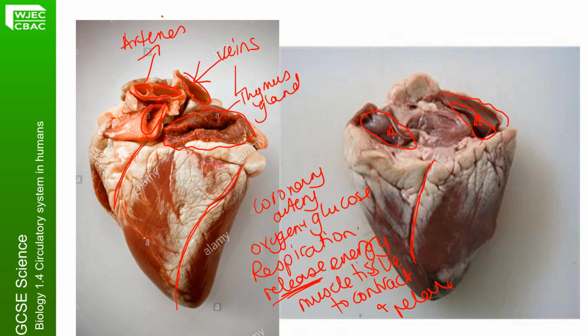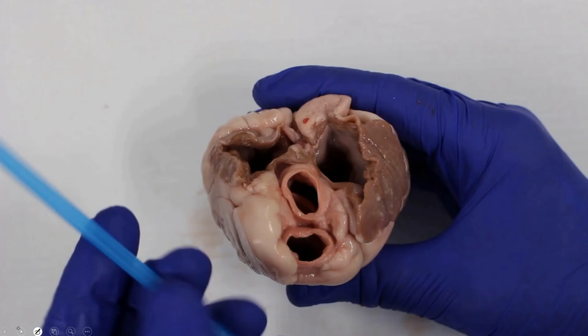It's not just the arteries and the veins that come into the top of the heart. Just a different view so you can see the difference between arteries and veins. This is our really, really thick wall, okay, of our artery. And this person has got a straw here, which they would put down the holes of the artery, okay, so that we can see the different sides. These would be our veins here. Arteries tend to have a more rounded shape, veins more squashed. So I'm just going to label these V, and these are A, arteries. Okay, it looks like a little face.